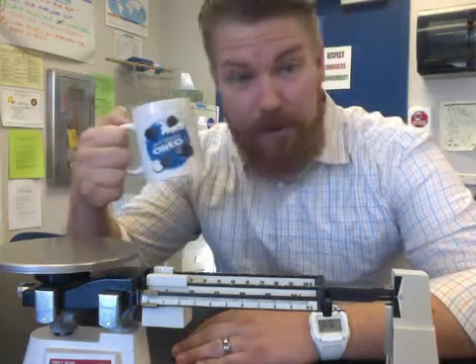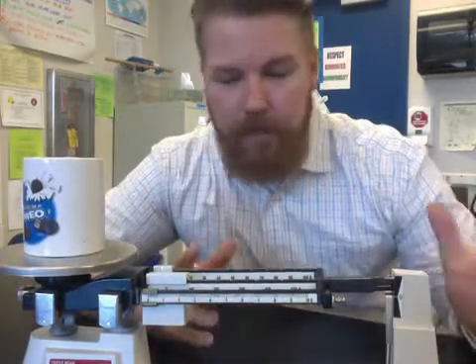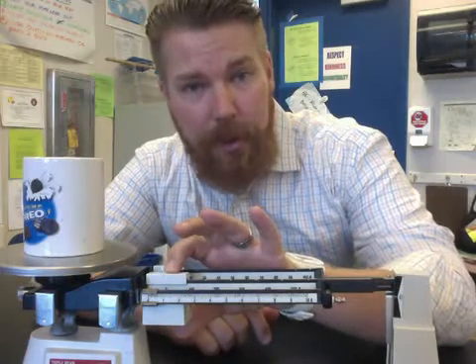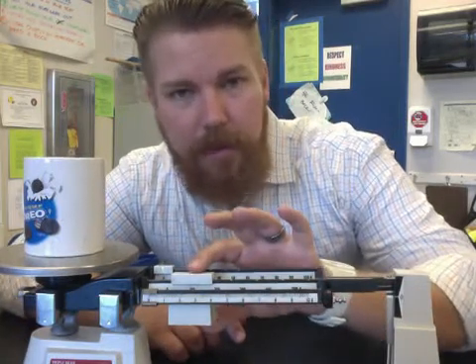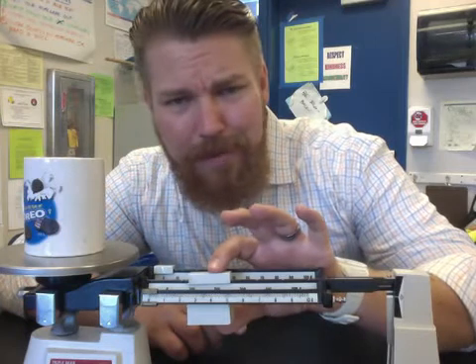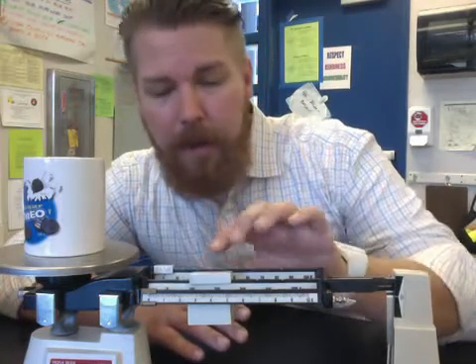Now we can put our object that we want to find the mass of on our balance. I'm going to use an Oreo cookie mug. We need to start moving these weights around until our balance is just perfect. Start off with the 100-gram weight. Very important: every time you move it, make sure it falls into that little notch. Don't leave it in between — it's not accurate because you don't know where exactly it is. That's why we have the 10-gram and the 1-gram weights — we'll use those later.